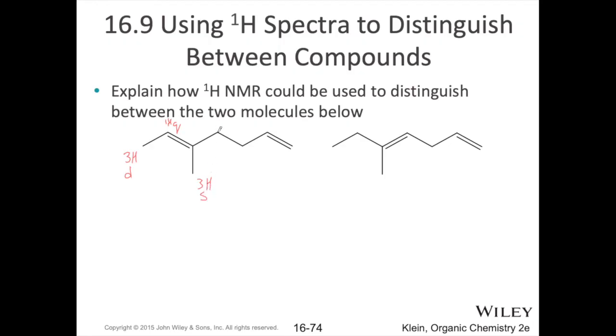Now here we have two hydrogens, so we'll have an integral of two hydrogens. Again, we established that these hydrogens are too far away to split that: 1, 2, 3, 4 bonds away. But over here we have two other hydrogens, and those would be only 3 bonds away. So we've got two hydrogens here, and this would be split into a triplet by these two hydrogens here.